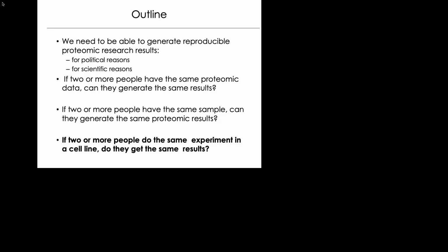all with SciEx instruments, because at the time this was the only real instrument that could really do this type of acquisition. And I would be certainly surprised if one did the same thing on a Thermo instrument or a timsTOF, if the results were very different. In fact, Thermo has now repeated basically the same design of study, and I think at ASMS they want to announce how this worked, and the rumors are it worked also very nicely.